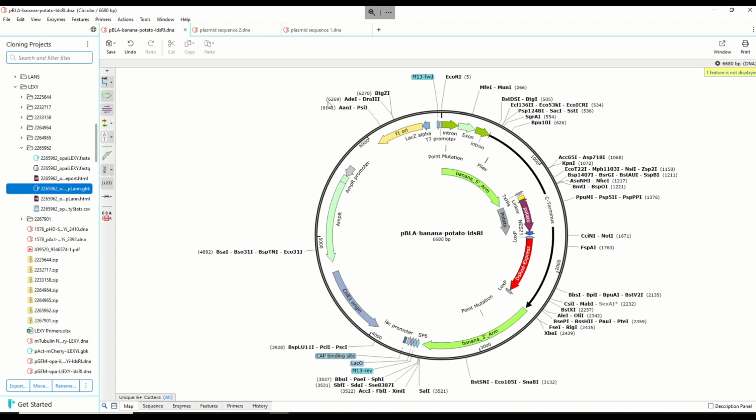But today it's just going to be how you do it in these 3 softwares, because multiple new students in the lab, trainees in the lab, have had to learn this and ask a lot. It's very straightforward, very simple seeming, but I think this will be helpful at least to a minority of people. So let's get into it.